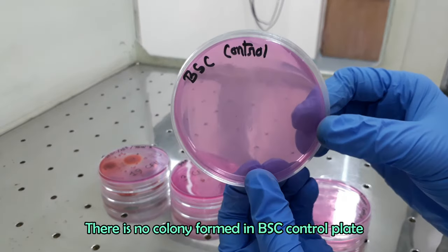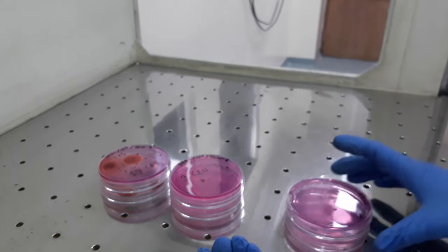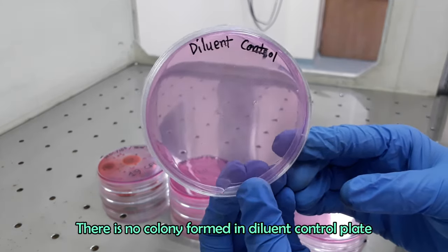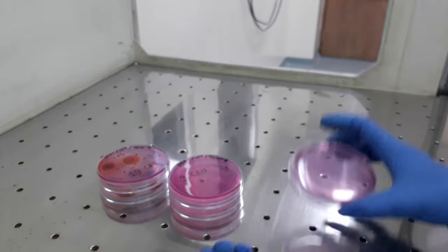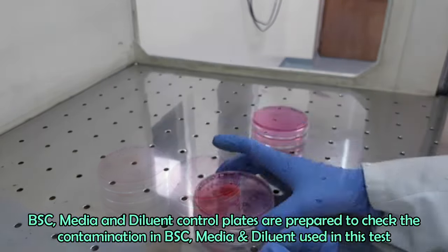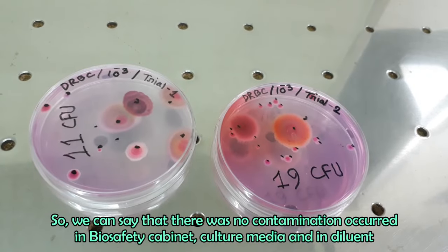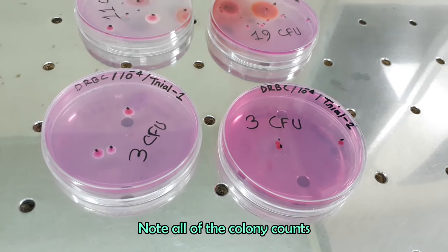This is biosafety cabinet control plate. No colony is found here. This is diluent control plate and this is media control plate. There is no colony formed in the media and diluent control plates. Hence, we can say that there was no contamination in culture media and diluent. Note the counting results.